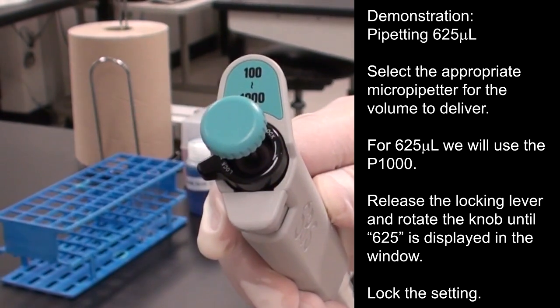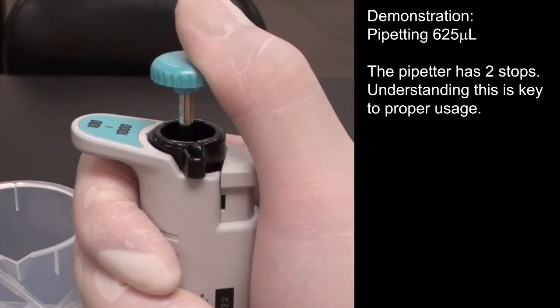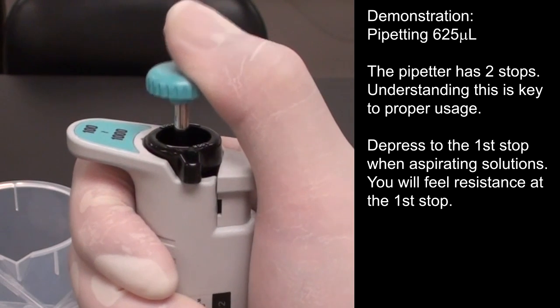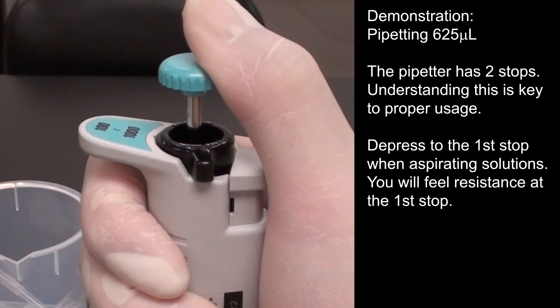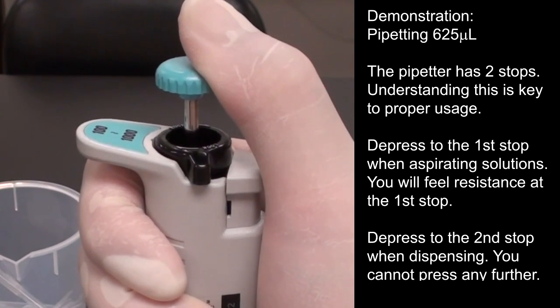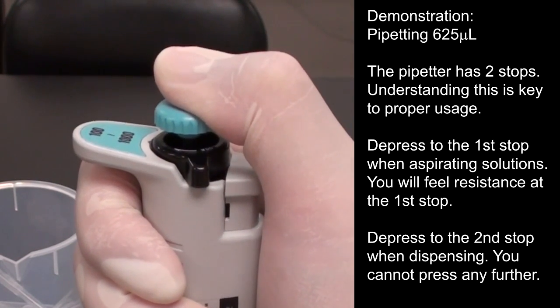The pipetter has two stops. Understanding this is key to proper usage. Depress to the first stop when aspirating solutions. You will feel resistance at the first stop. Depress to the second stop when dispensing. You will not be able to press any further.